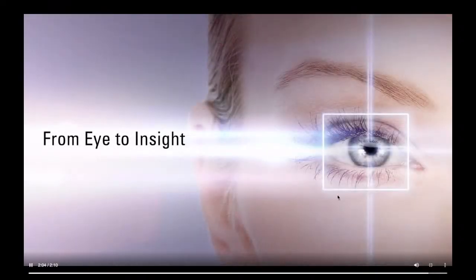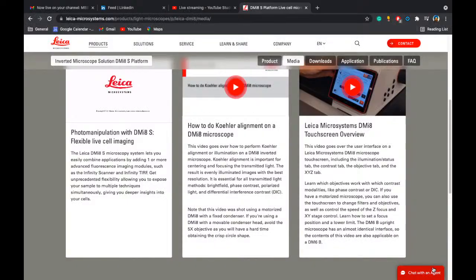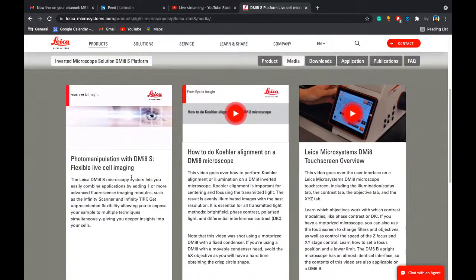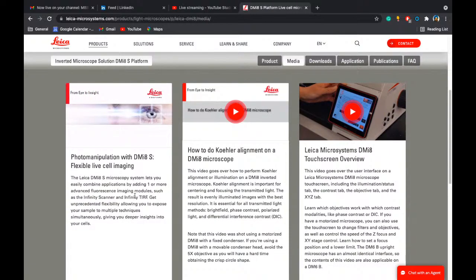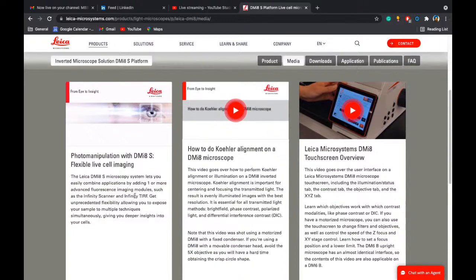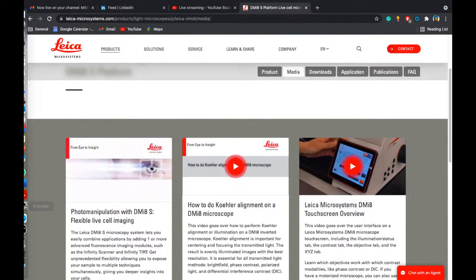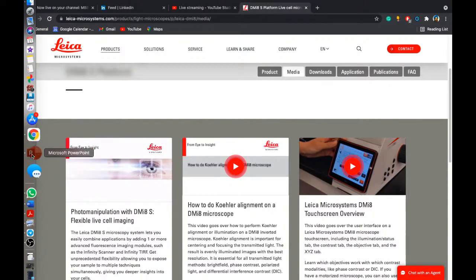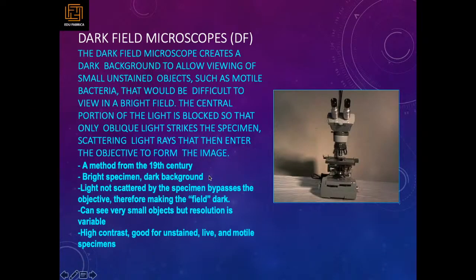So it was a very advanced microscopy that they were telling about. I was not aware of that. As they suggested, ablation, photo activation, all these things could be done with the help of it. This is a recent production of this microscopy. So it indeed has a lot of advantages over the other one.